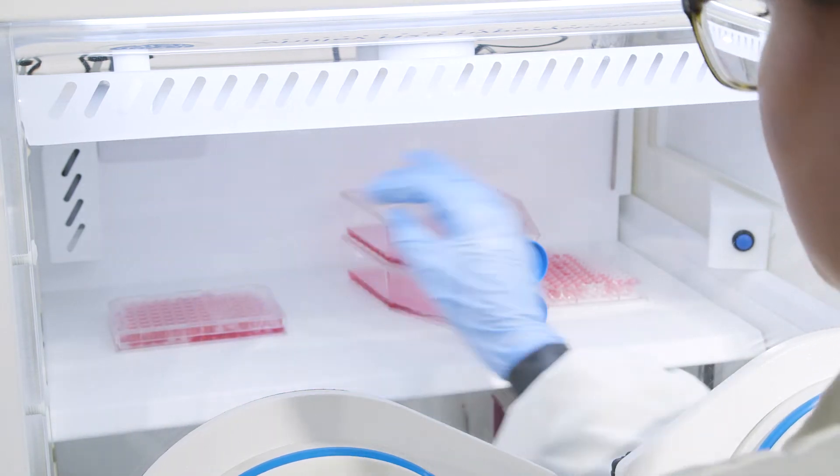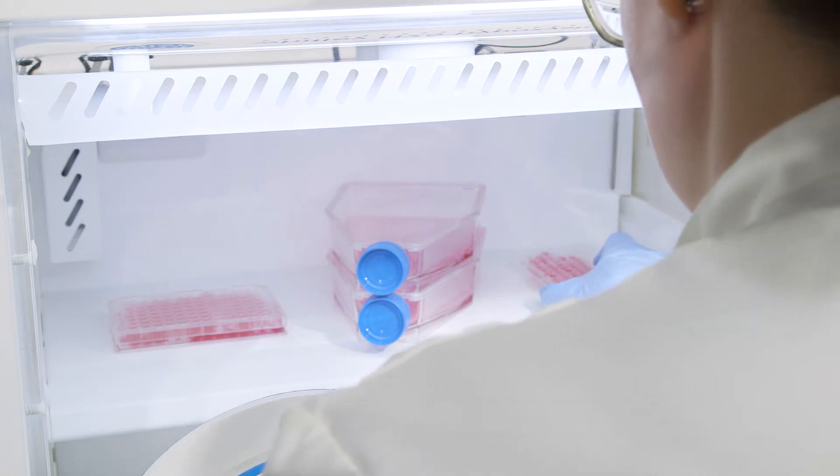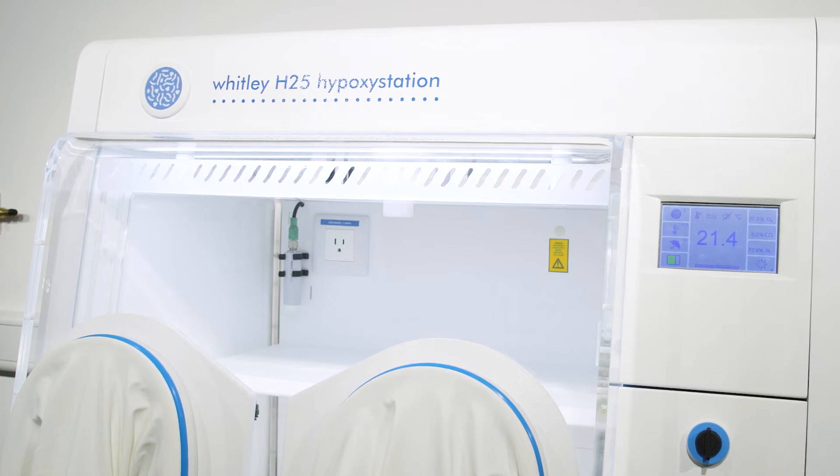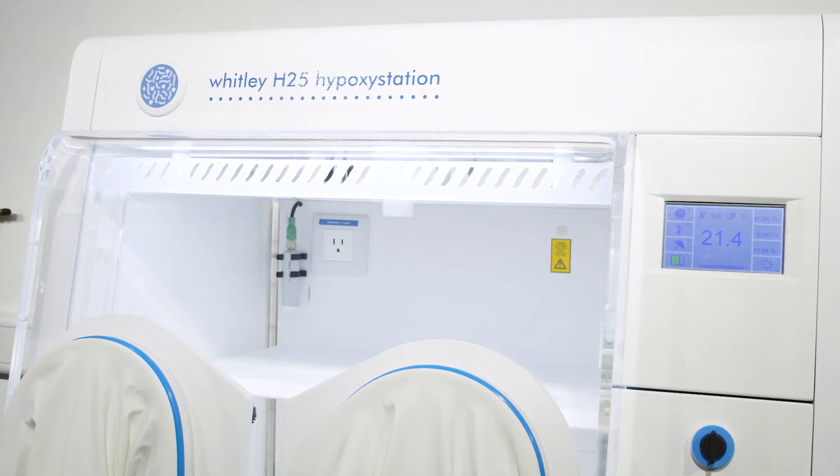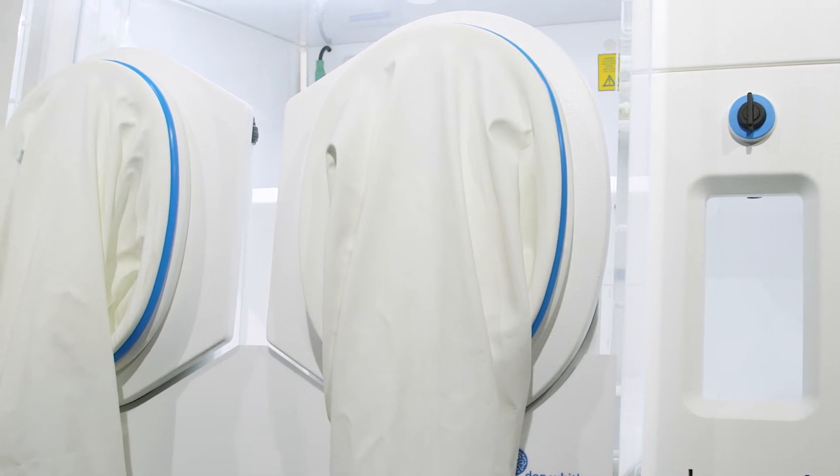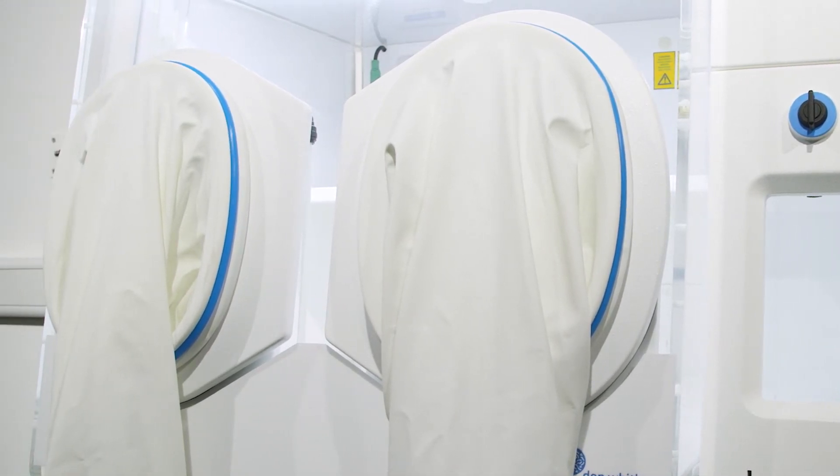The H25 is equipped with many unique features to ensure easy and efficient use and to guarantee that the very best hypoxic conditions are maintained. The H25 is fitted with a new porthole system allowing greater freedom of movement and operator comfort.